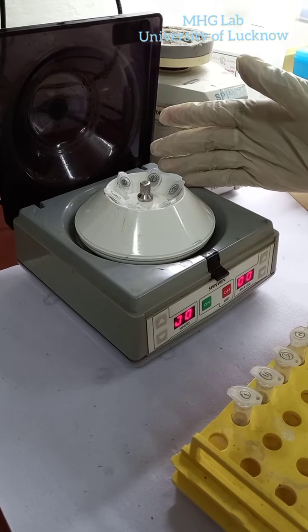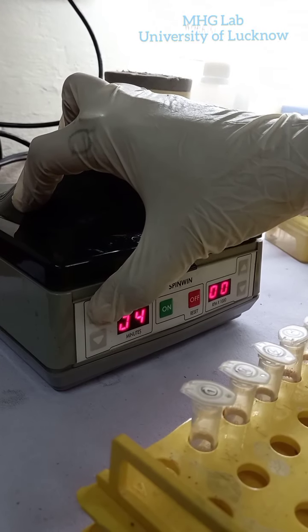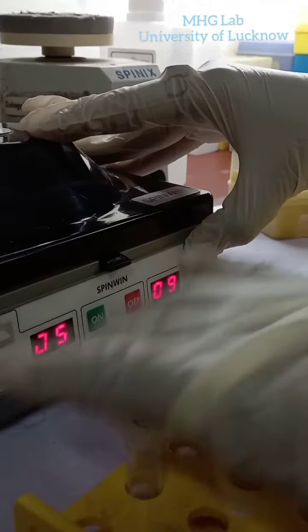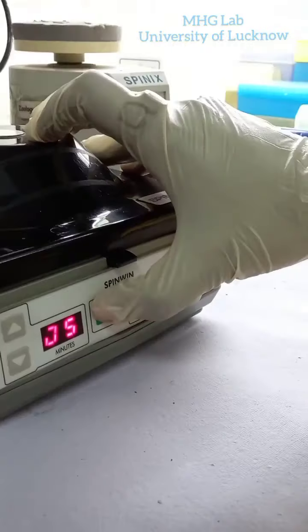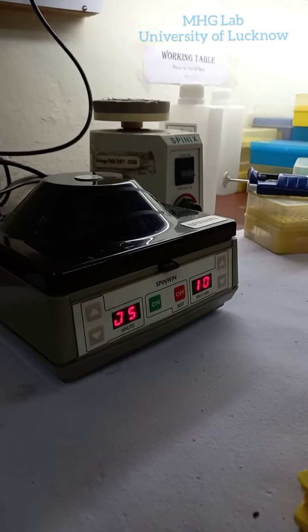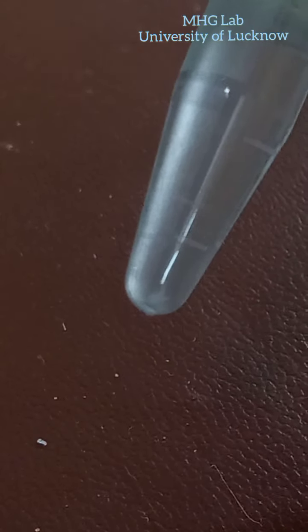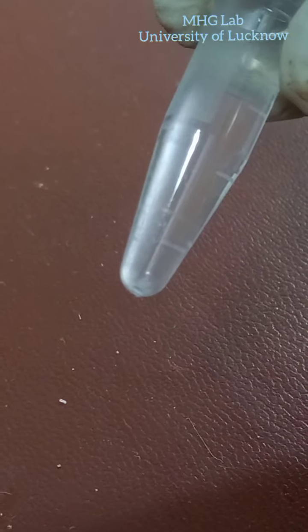With the DNA in pellet form, we will centrifuge the DNA for 5 minutes at 10,000 RPM. Here you can see RPM is equal to 1000, so 10 into 1000 is 10,000 RPM. After centrifugation, we can see the DNA in pellet form settled at the bottom. This white point seen in the tube is the DNA.